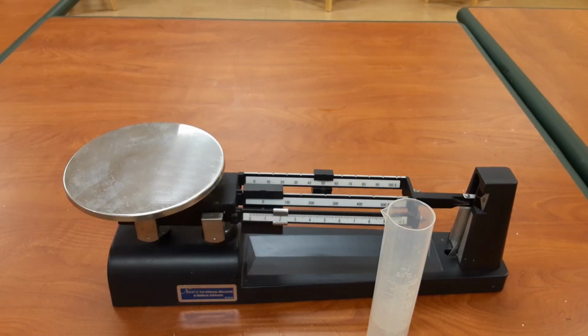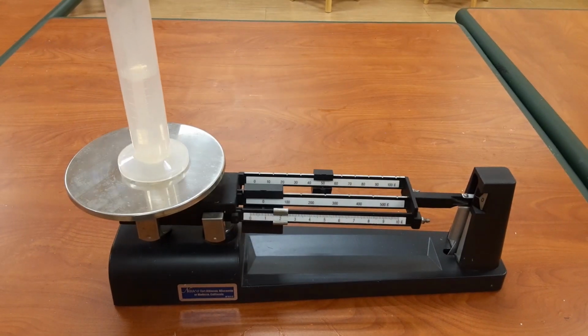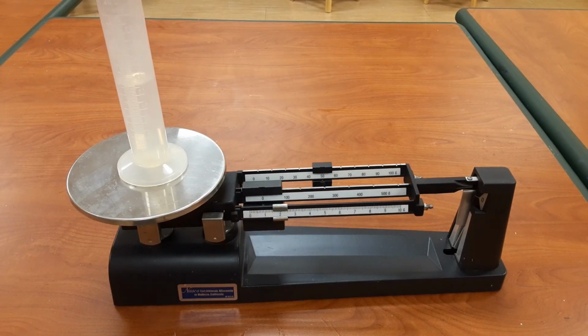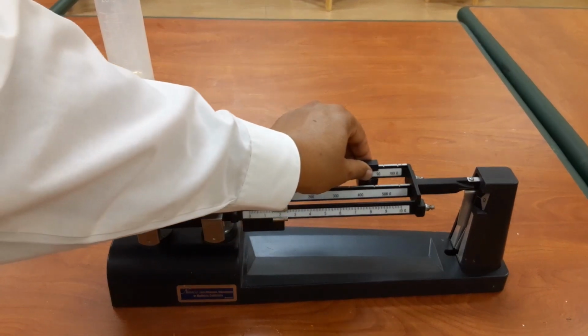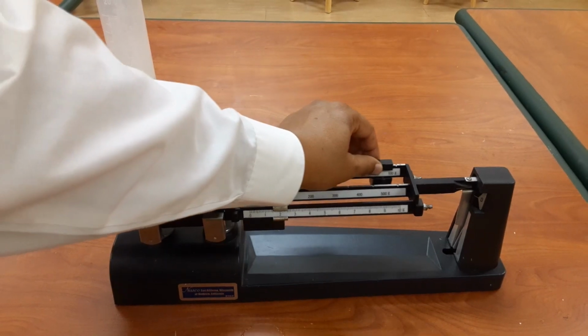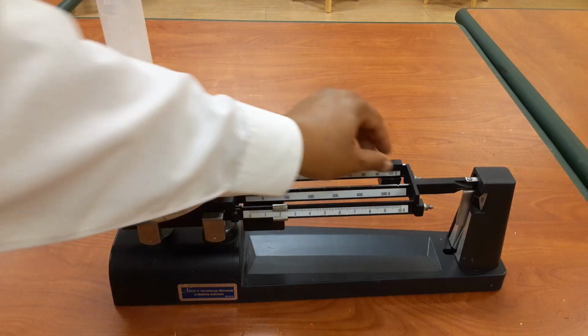Next we take the graduated cylinder and we place it on top of the triple beam balance pan, and we see that the beam has gone up. So let's move it all the way to 90, move all the way to 100, and the beam still stays up. It means that the mass of the water and the graduated cylinder is more than 100.